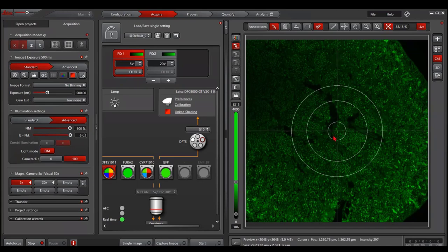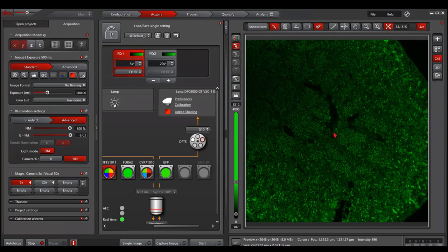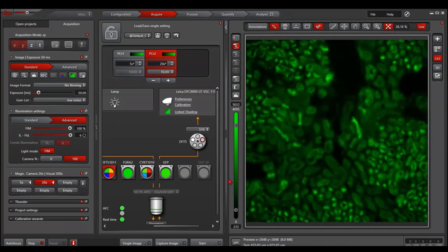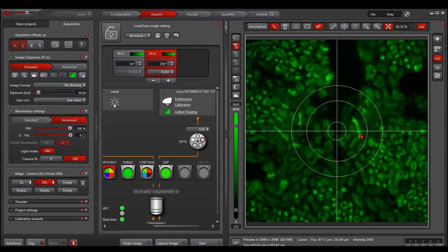Ctrl T to indicate this little fiber is at the center I already focused on. So now if I switch to 20x, I see the same object is slightly out of focus and it's off of the center.